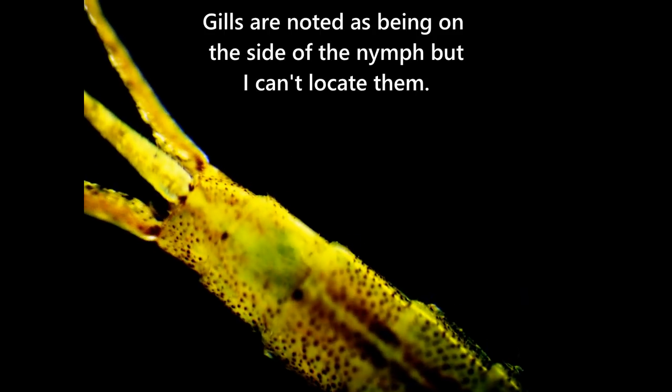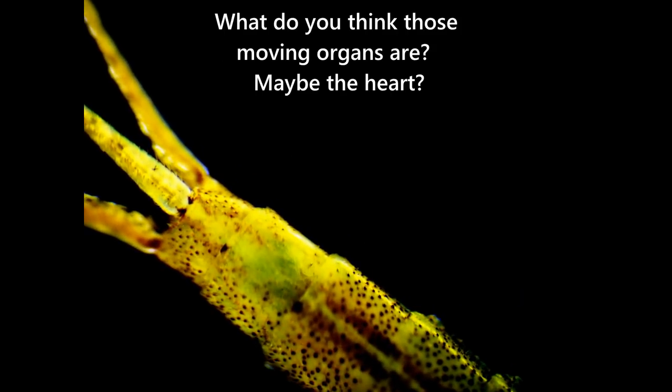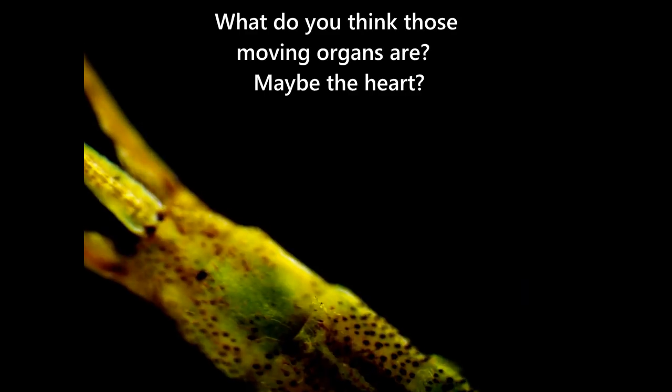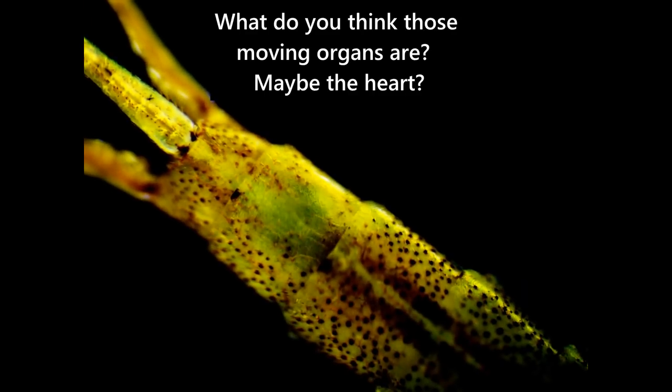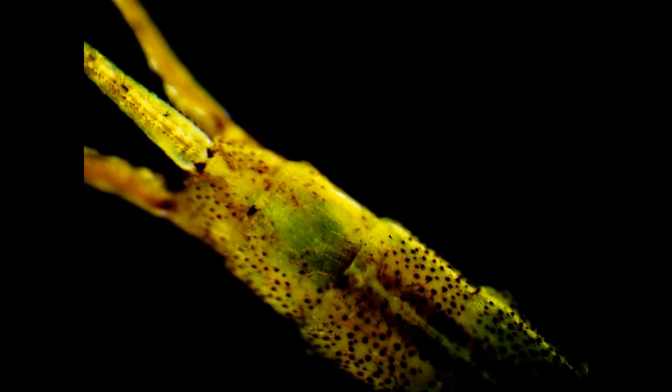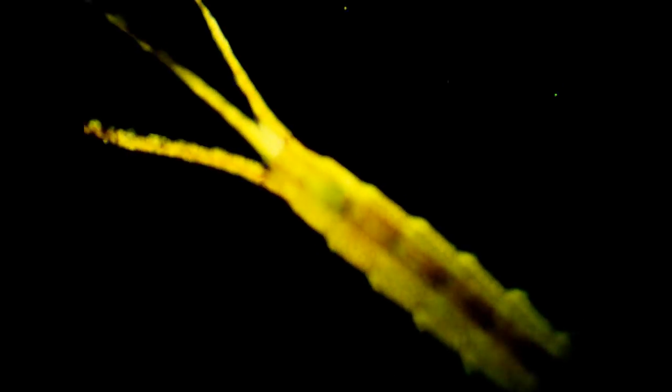So I'm going to let me see if I can zoom in on this guy, get a better look. Look at that. Is that awesome or what? That's so cool. Look there.